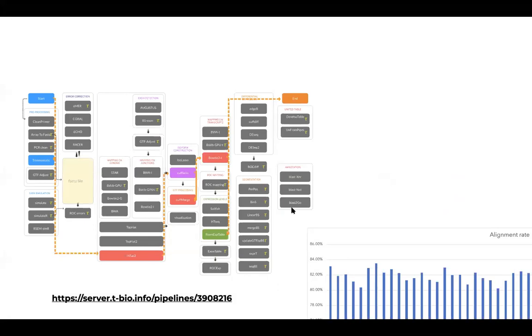The genome has to be indexed. You have to have the right GTF file, which has to match with the specific names of genes and the specific positions on that genome. So that's one of the challenges that you wouldn't experience with your standard model organism study. And that's why you can see here the pipeline is actually mapping on genome and then constructing those isoforms and preparing a new GTF file that would then translate into transcriptome quantification. So I think that's a good illustration for where you would not just go through your standard quick pipeline.